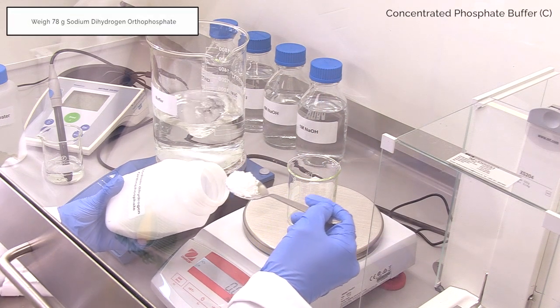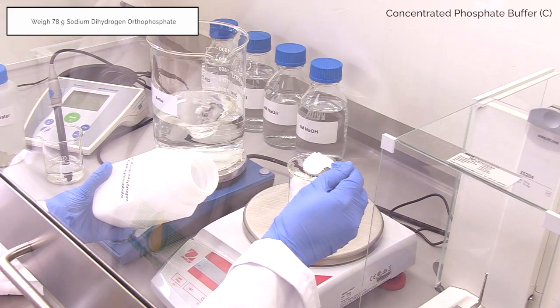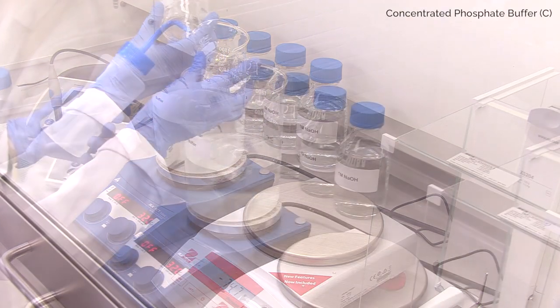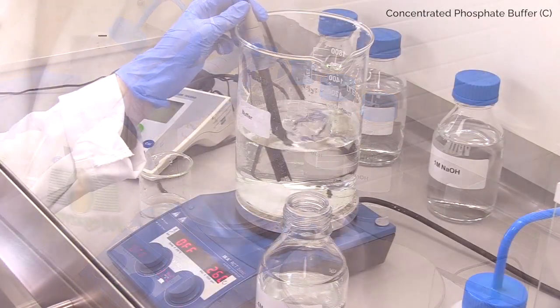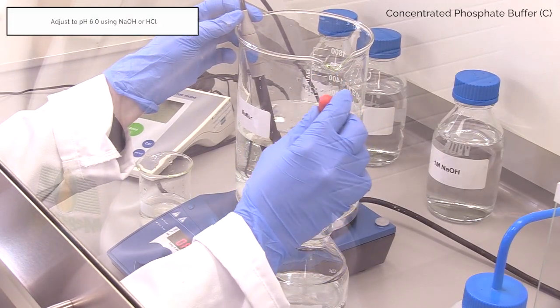Weigh 78 grams of sodium dihydrogen orthophosphate and add this to a stirring beaker of 800 millilitres of distilled water. Wash the original beaker into the 800 millilitres of distilled water using a wash bottle. Adjust pH using 4 molar NaOH until pH 6 is reached.